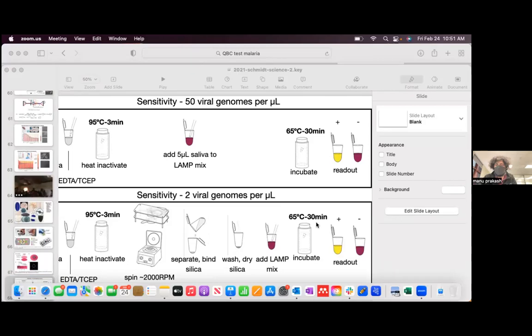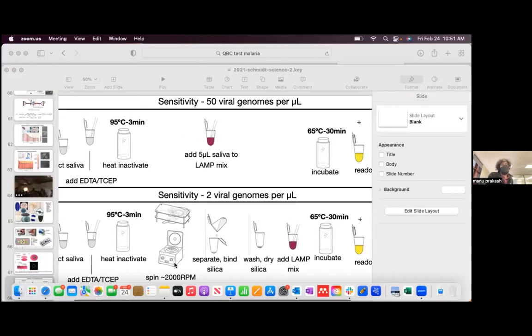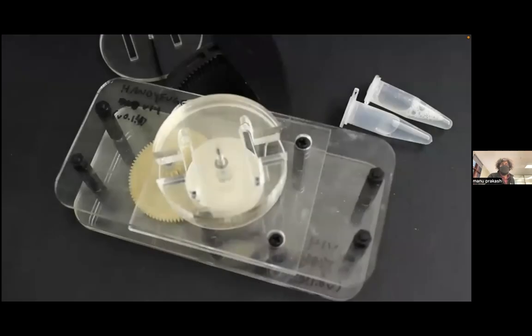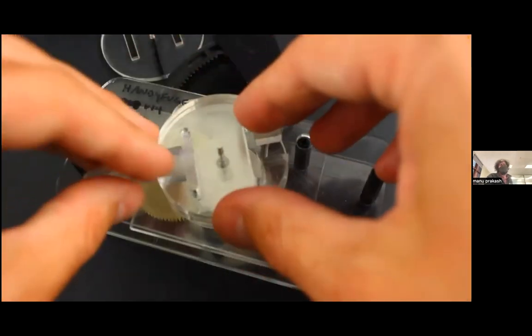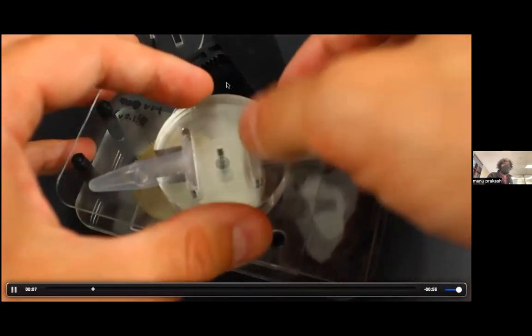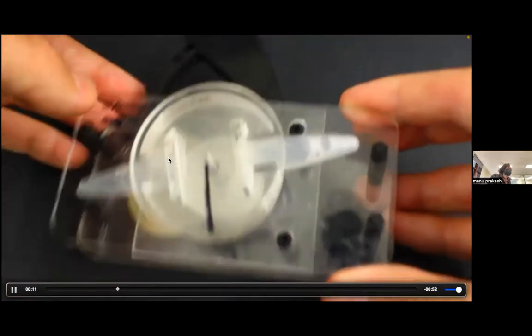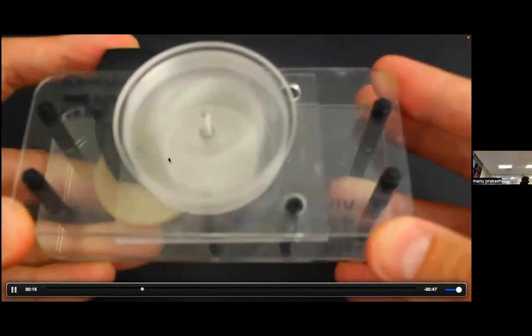And so the one that was needed in the context of COVID was a much smaller, slower RPM. So that's 2000 RPM roughly. And I'm just going to play this video to show you guys. And then this is even a later version. And then there are a couple other versions after this that are even more stable. But now you can see we can do roughly all the way to 1 or 2 ml of samples. The classic paperfuge can't do that.